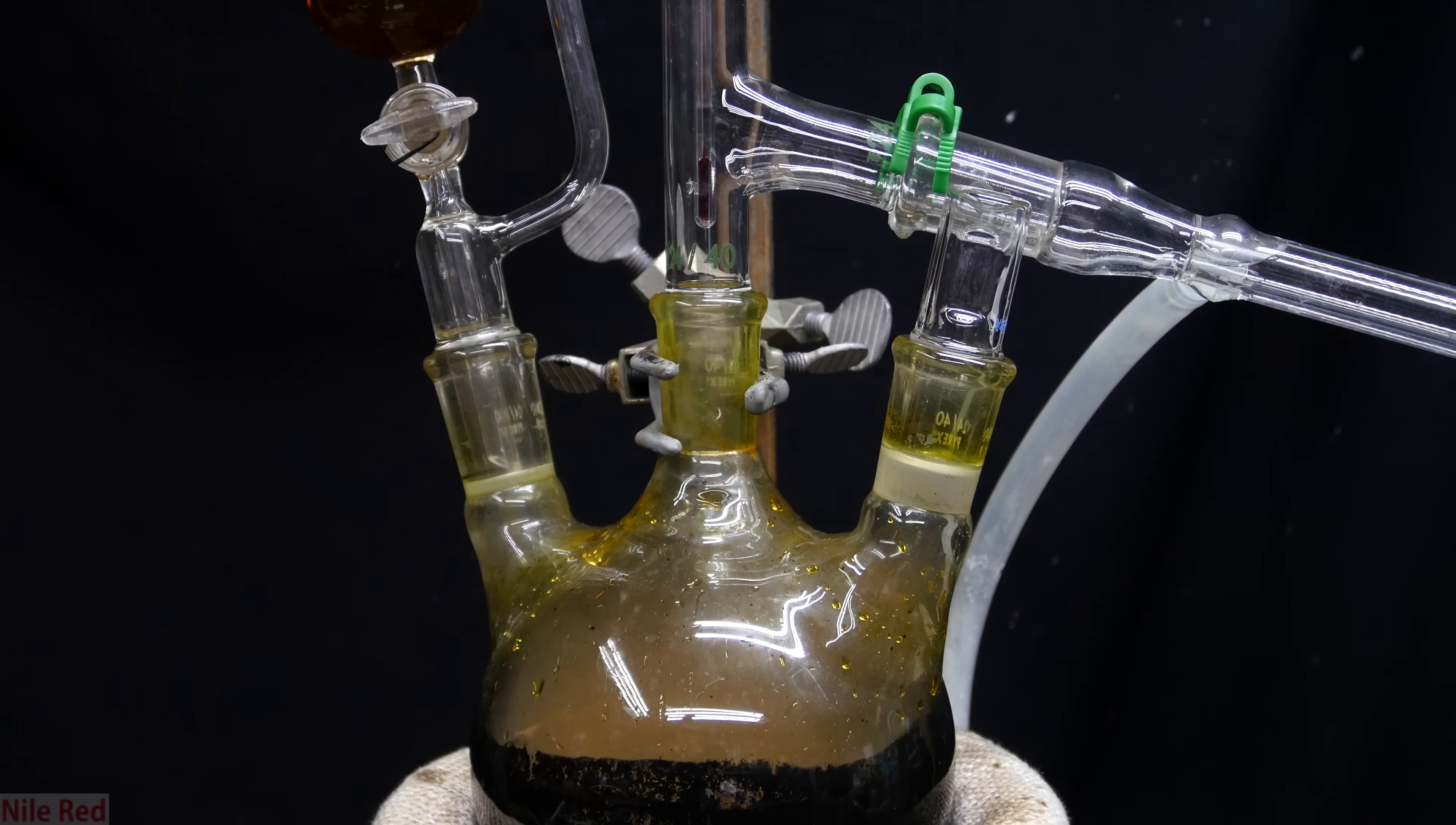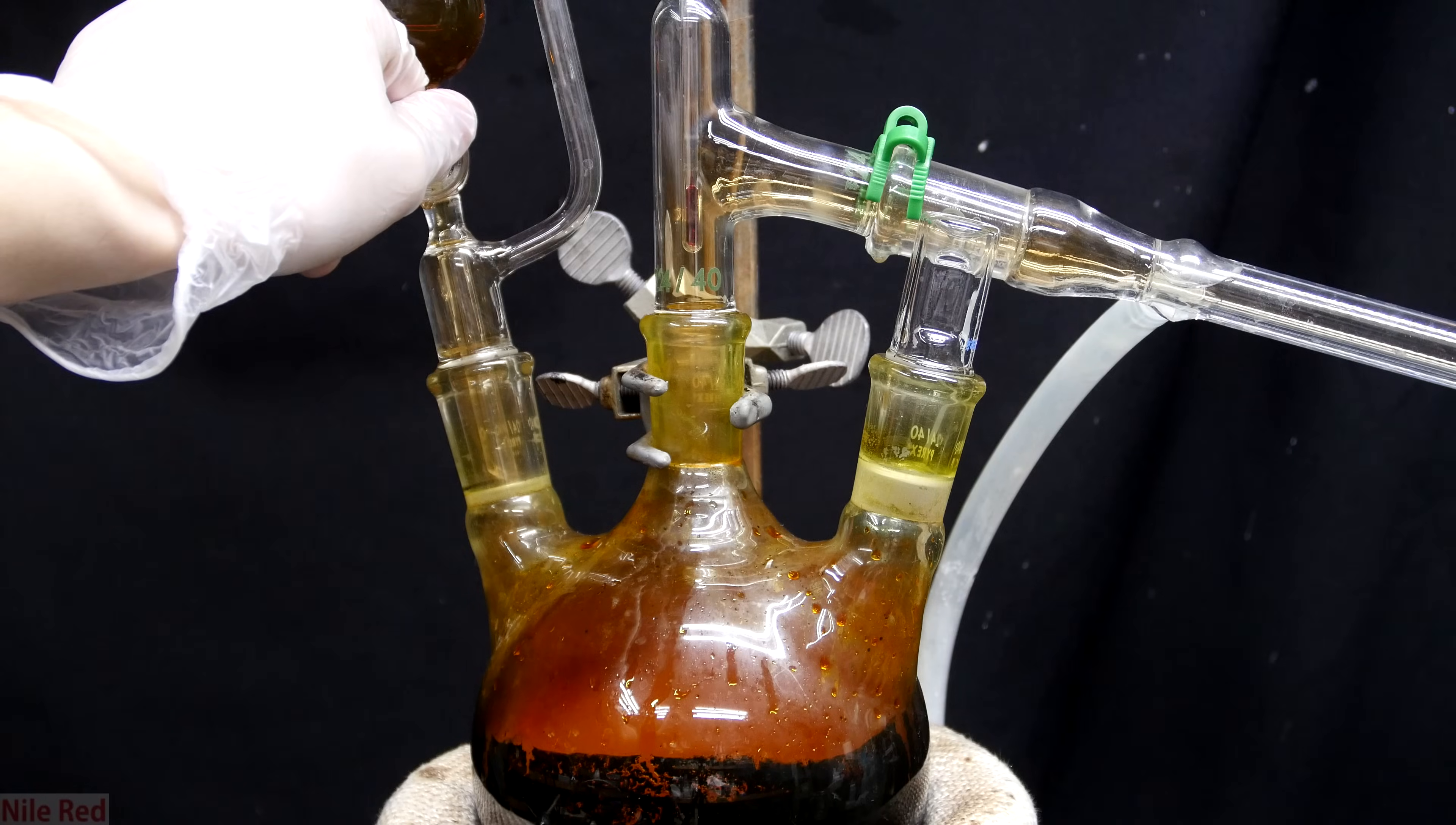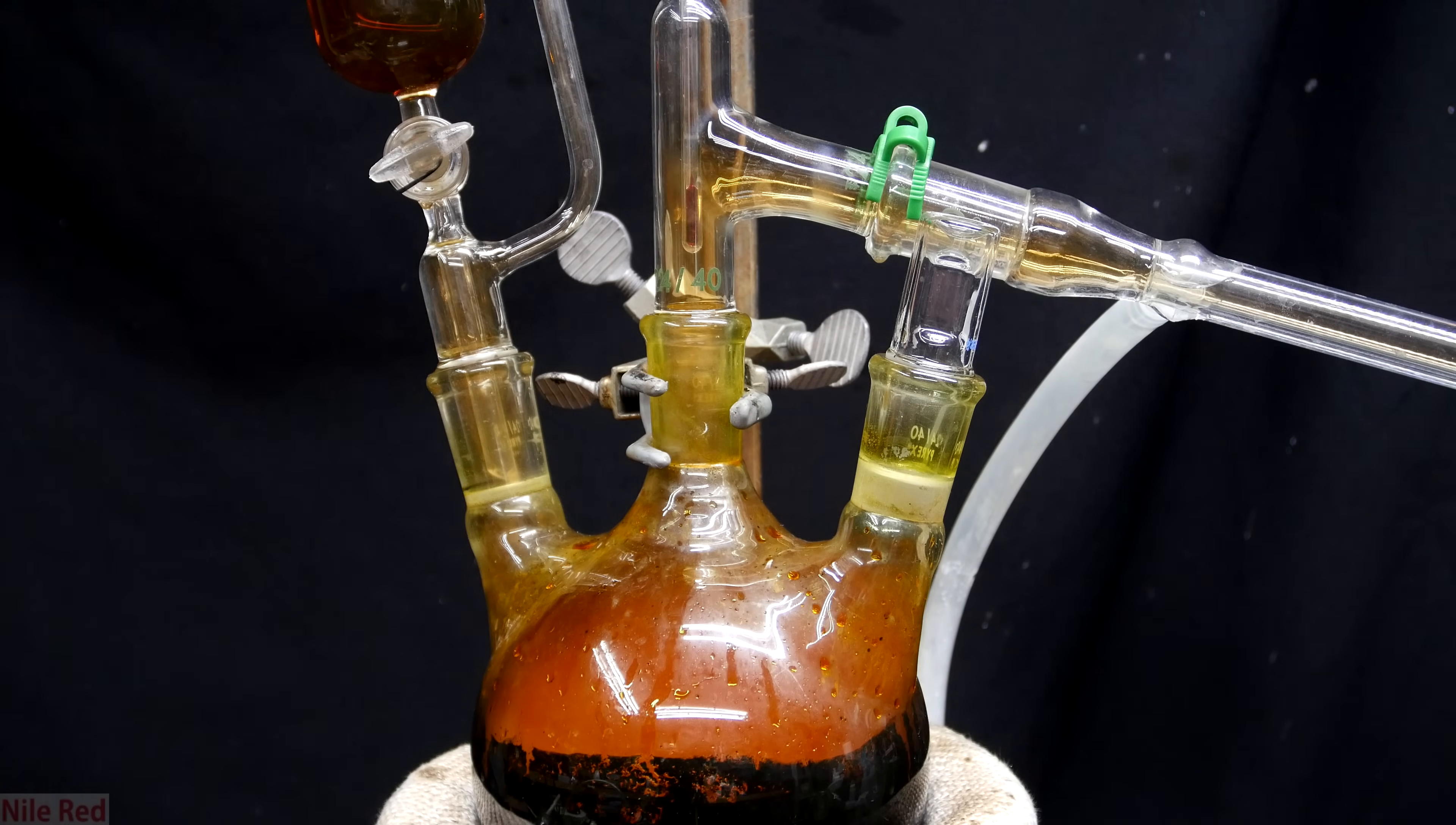It might be a little bit hard to see, but the fumes actually have a faint orange color. As we add more, it'll take on a darker and darker reddish orange color. If you look above to the part where the distillation apparatus is connected, you can see that some of the orange vapors are starting to make it over.